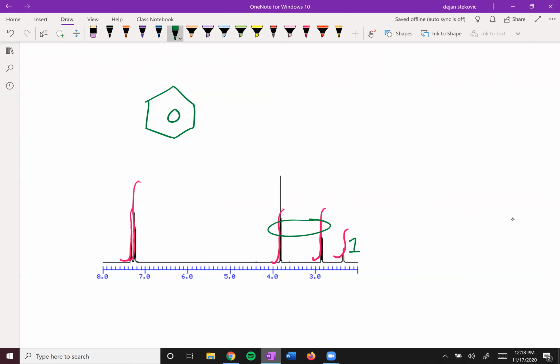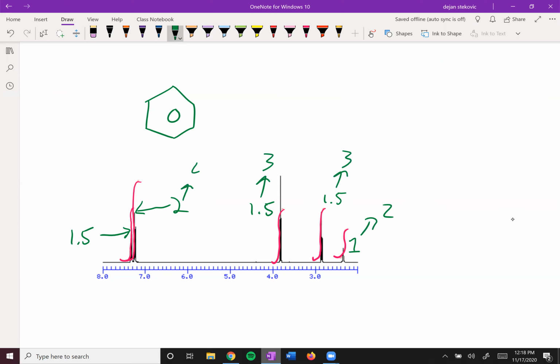Both of these guys seem to be 1.5 times the size, so 1.5. This one is also to the left here, 1.5. And then this one looks to be about 3 times the size, or maybe just twice. Yeah, we'll go twice the size of this other compound, right? And so we can't have 1.5 carbon, so we have to round it up, right? So this has to go to 3, this has to go to 3, this has to go to 2, this has to go to 4, and then this has to go to 3.